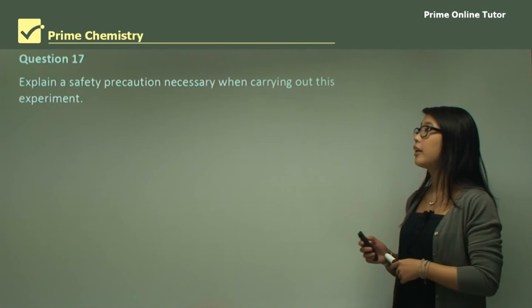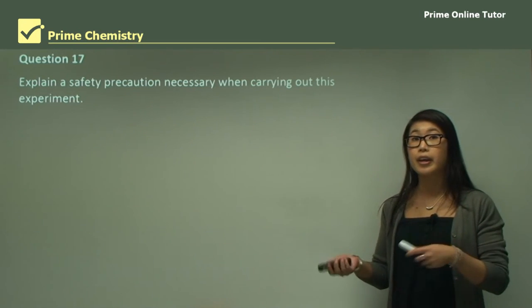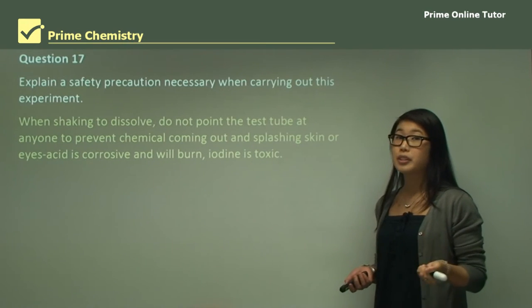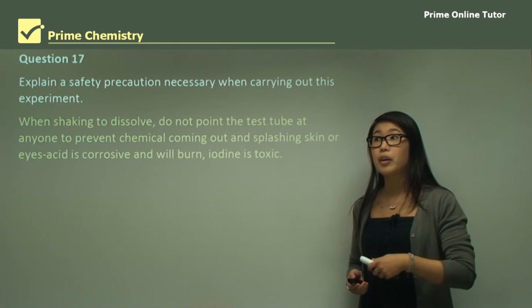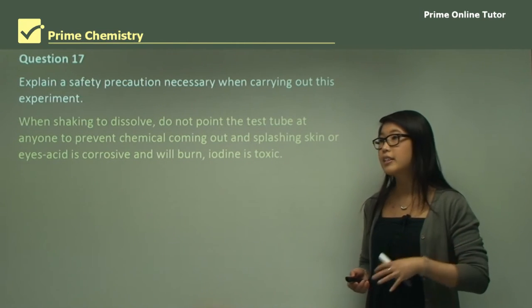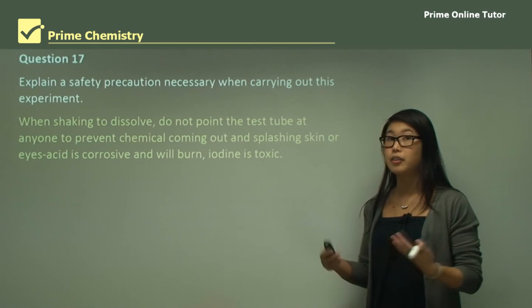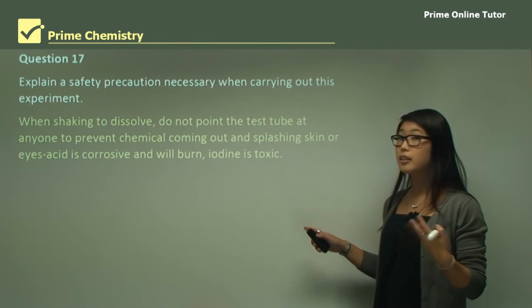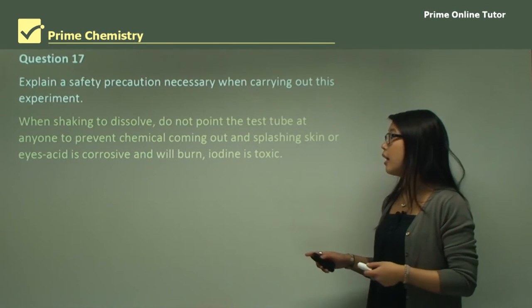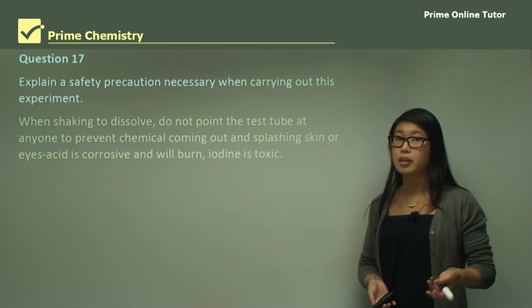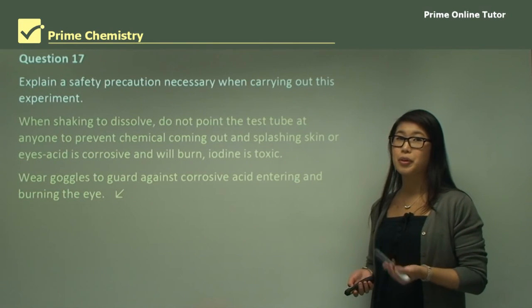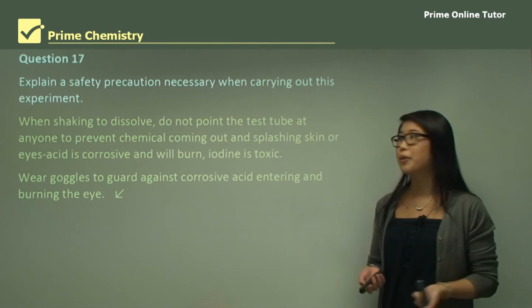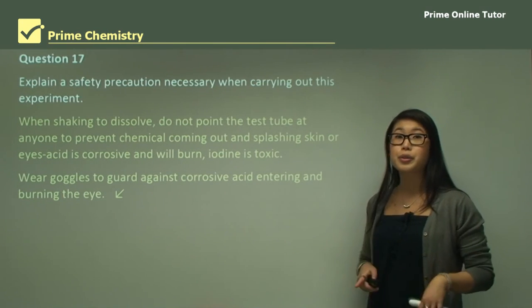Question 17: explain a safety precaution necessary when carrying out this experiment. When we're shaking to dissolve the substance, we need to make sure we don't point the test tube at anybody. If you accidentally let it go, it can fly into their face, or if the stopper comes out, the chemical can come out and hit them in the face. This is really important because some of the things will be acid that you're testing, and this can really burn your eyes, and iodine is toxic. We can also wear goggles to guard against corrosive acid entering and burning the eye.